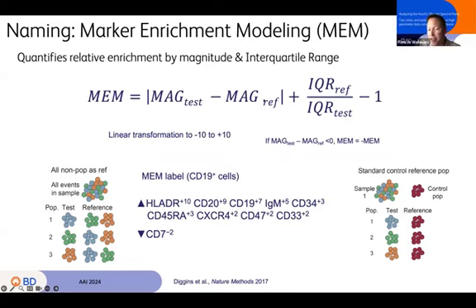And the reference is defined by you, the experimenter, something that will make sense and answer your biological question. So one example of a reference could be a control population. You could present some unstained or just negative for all cells of some kind or another. And so you're looking to see essentially relative positivity compared to some background. Alternately, if you've clustered, such as we're doing in this example here, for any one given cluster, you could use all the other clusters as the reference.